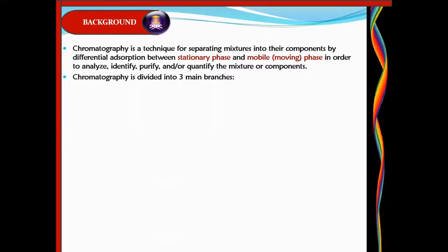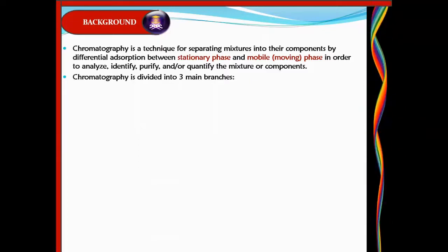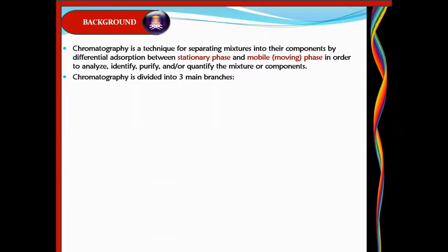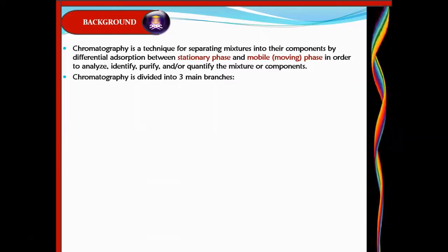So what does that mean? It means that it is an analytical technique commonly used for separating a mixture of chemical substances into its individual components, so that the individual components can be analyzed.